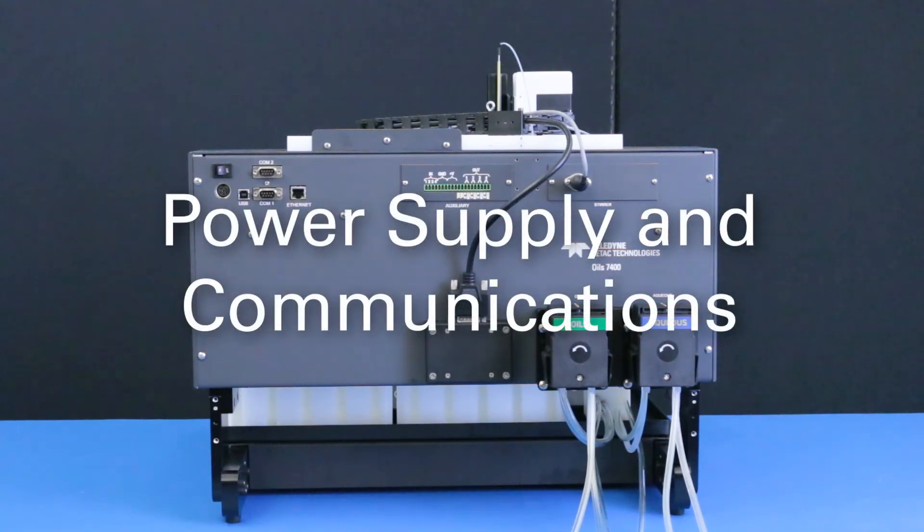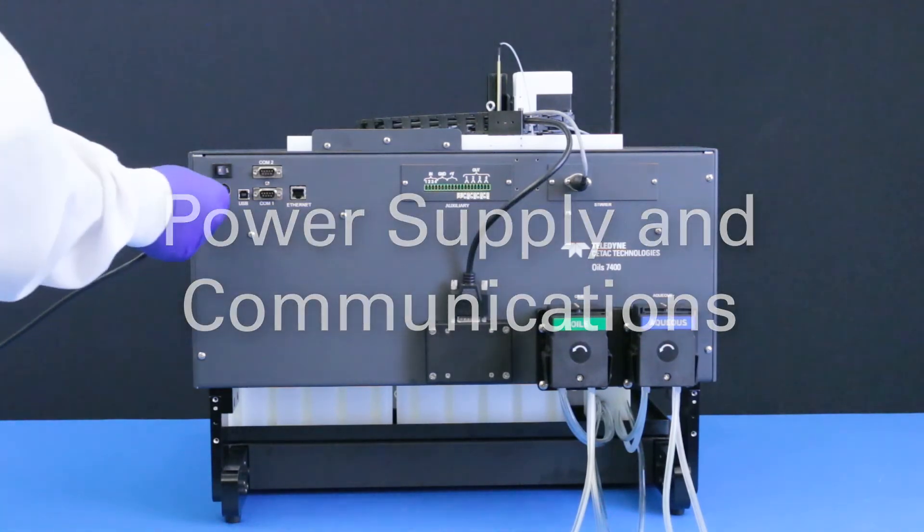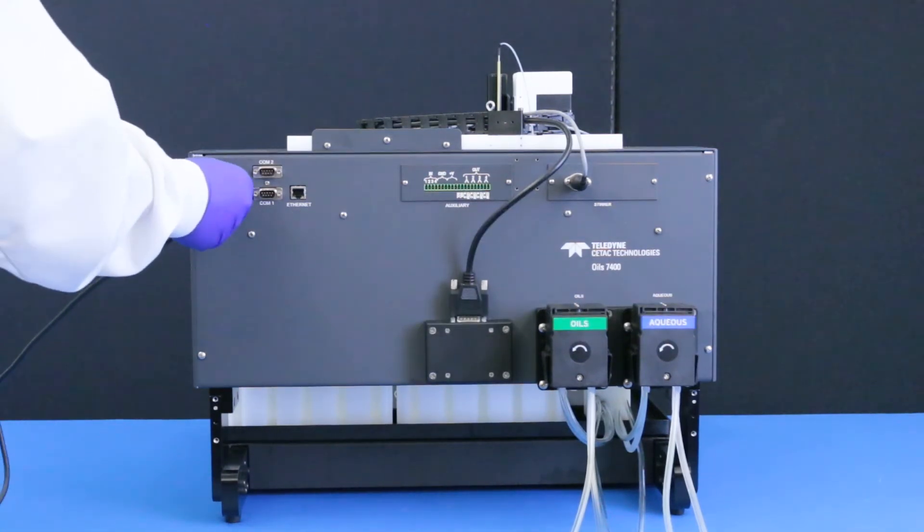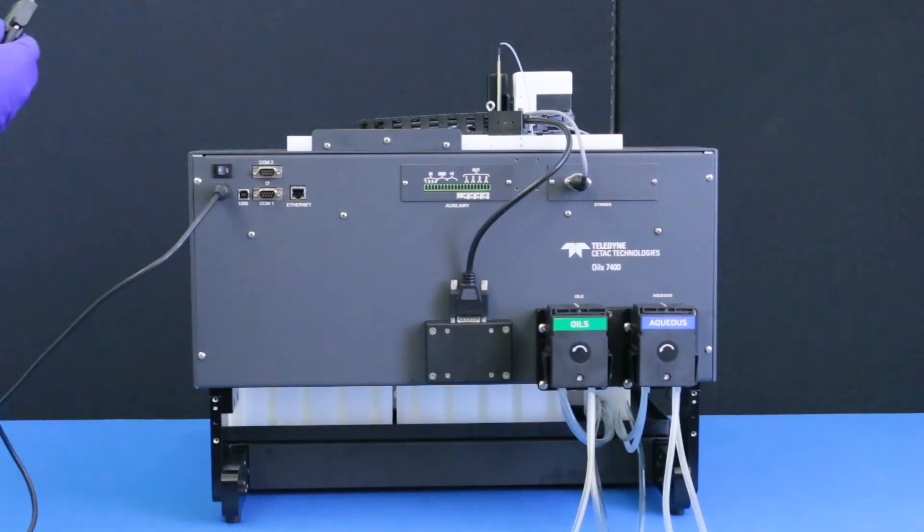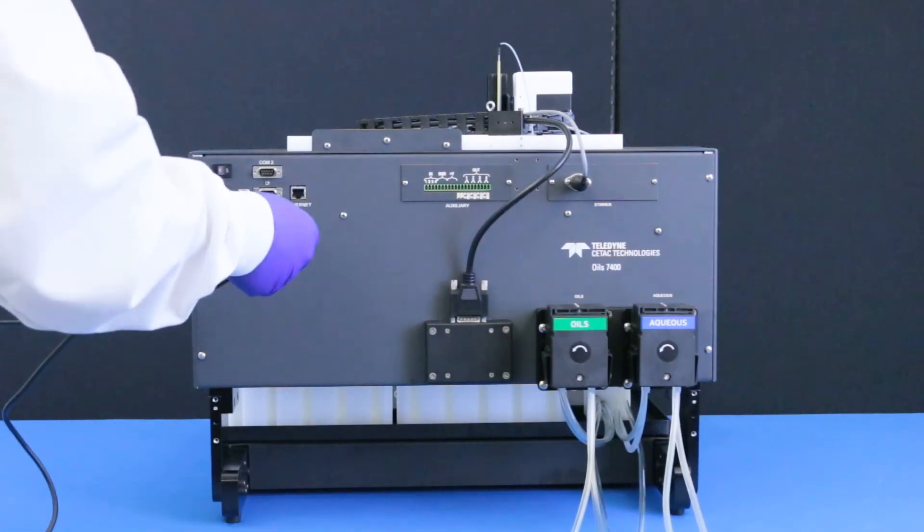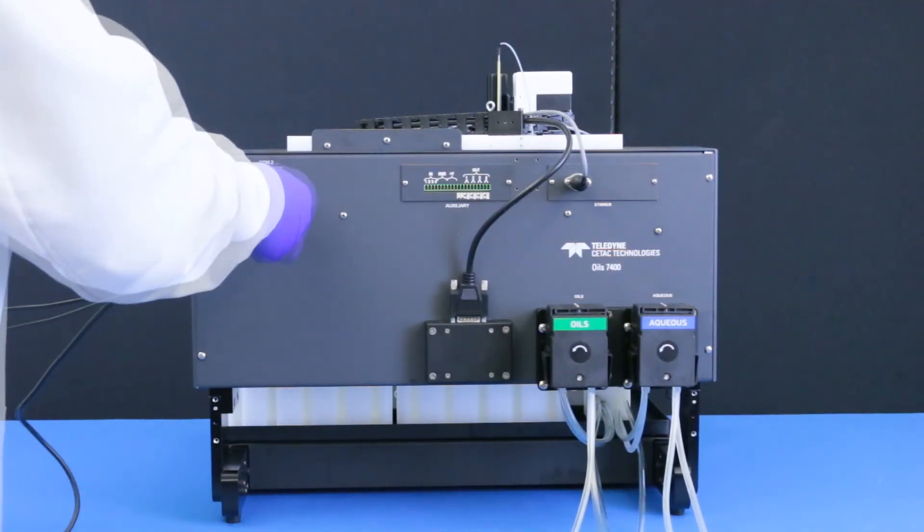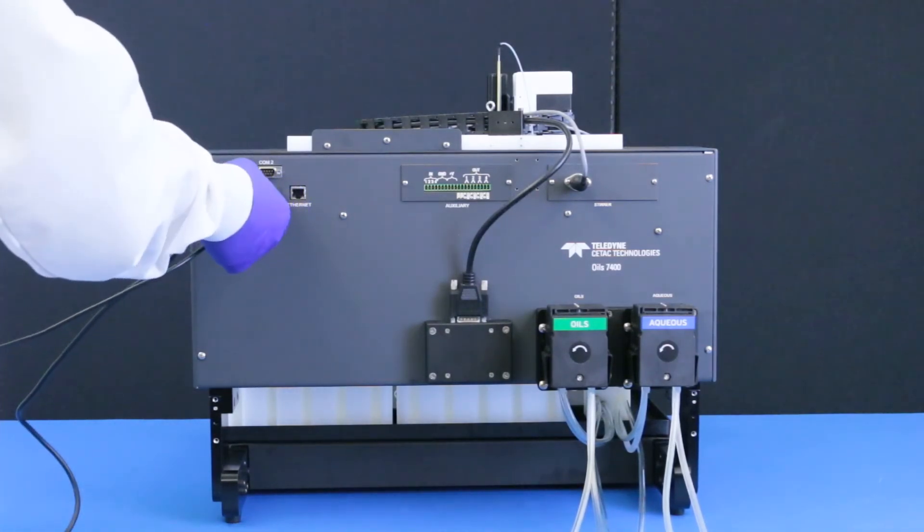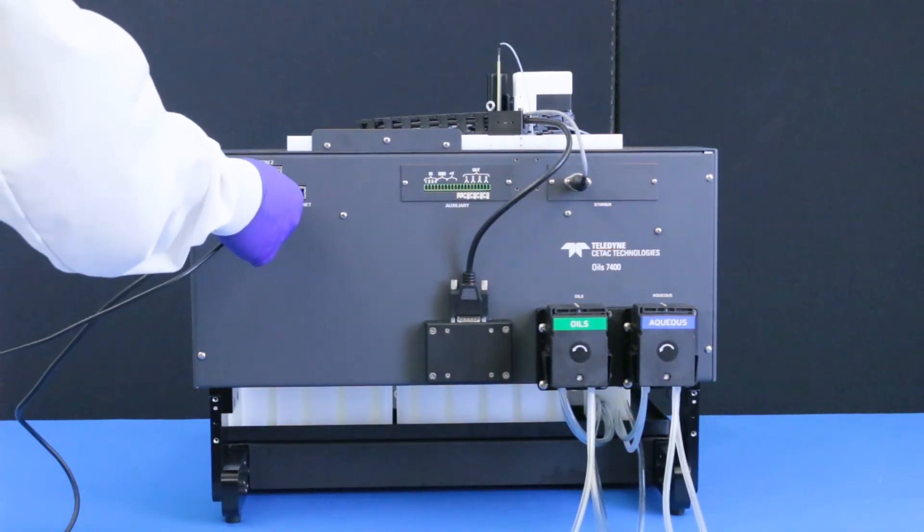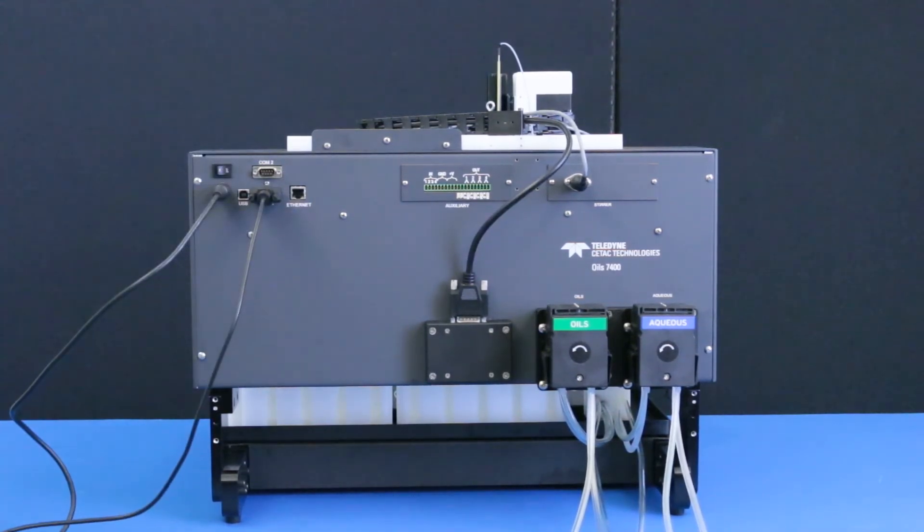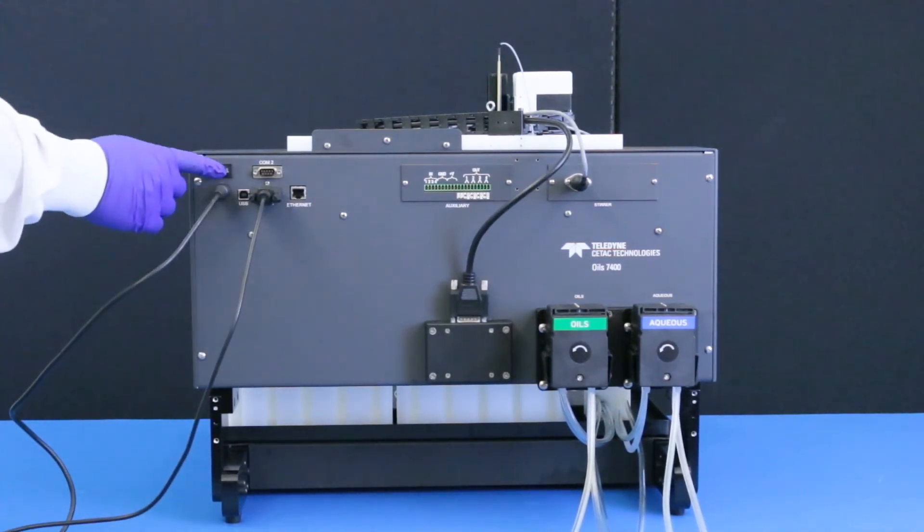Power supply and communications. Plug the power supply into the power connector on the autosampler. Connect either the USB or the serial cable between the host computer and the autosampler. Power on the autosampler.